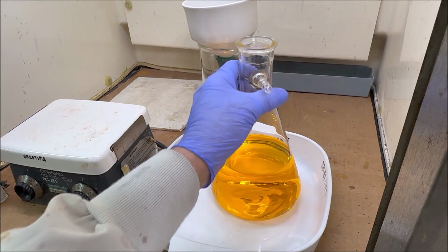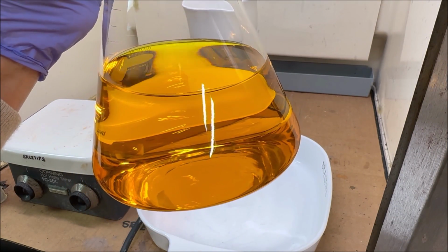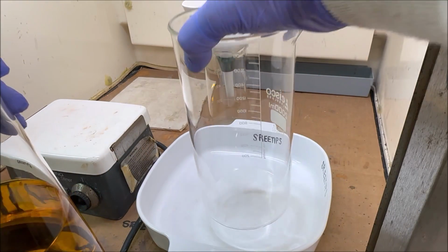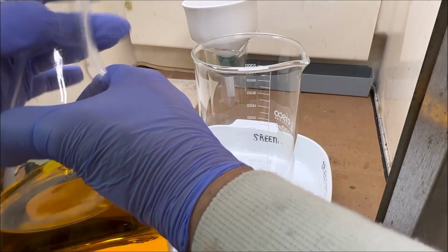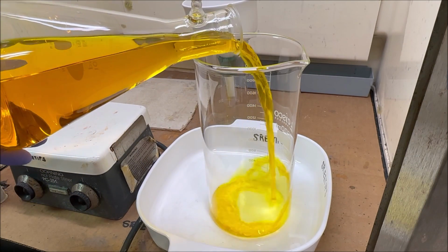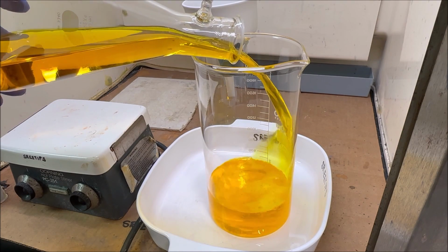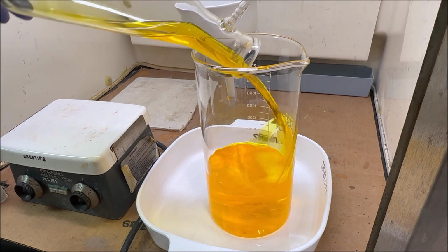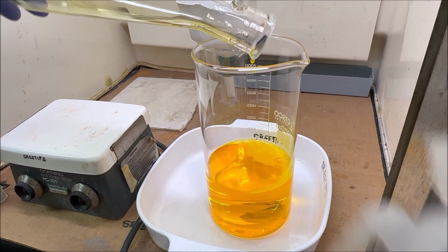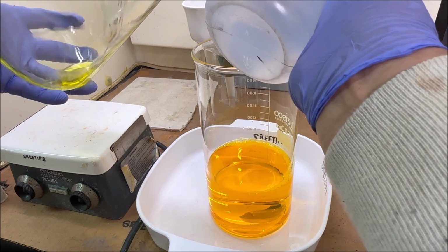I'm transferring our gold solution. Shouldn't have any nitric in there at all, because we didn't use any nitric to dissolve this gold. We used hydrochloric acid and hydrogen peroxide.